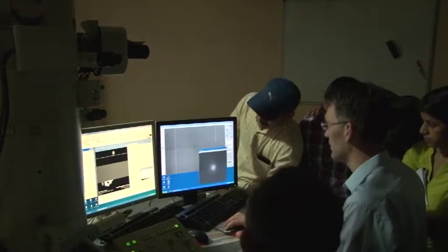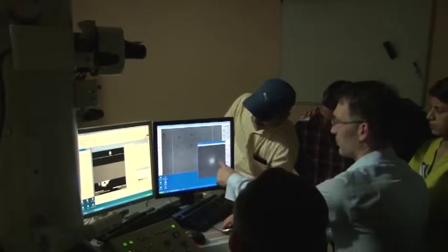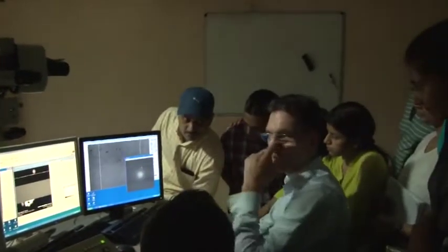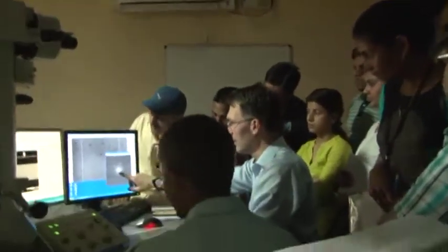Yeah. Oh yeah. So there is our image, it's amorphous, and this is the Fourier transform of this amorphous image. In principle, for an optimal system, it should be some white spectrum here, because all the frequencies in space contribute to such an amorphous material. But what you see is some rings here around.